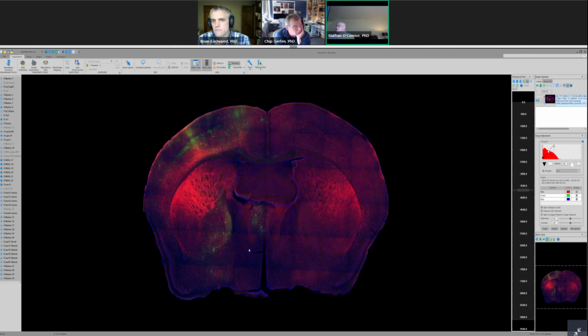And the other one is, yes, the software we've been looking at today is called NeuroInfo, and it goes from being able to line up all the serial sections into brain volumes to matching those sections into the Allen space, to doing this detection both with the cell strength methodology, this Laplacian of Gaussian or LOG, to using the classifiers that we've deployed right now. It is distinct from our NL360 software, which has some of this functionality, especially the deep focus, which is in common. But that software is more for model-based detection of things like dendritic processes and spines at a much higher resolution.